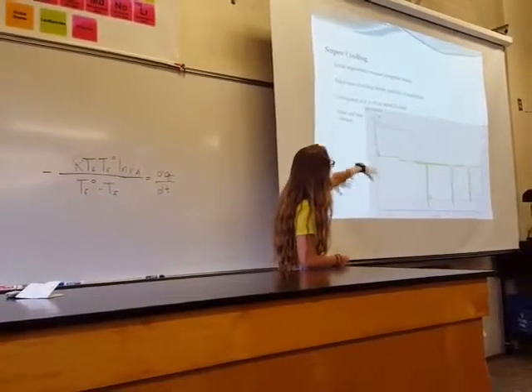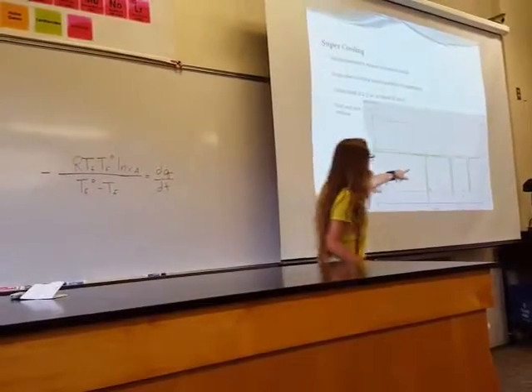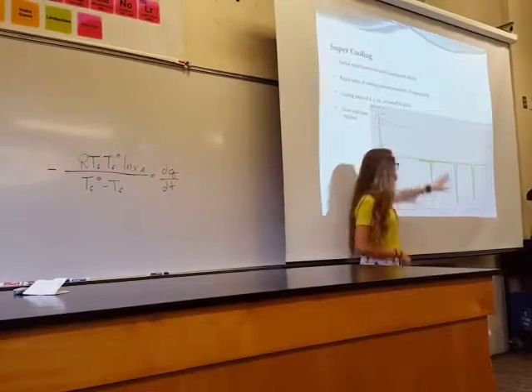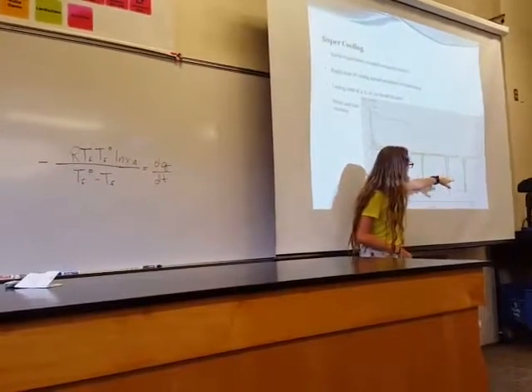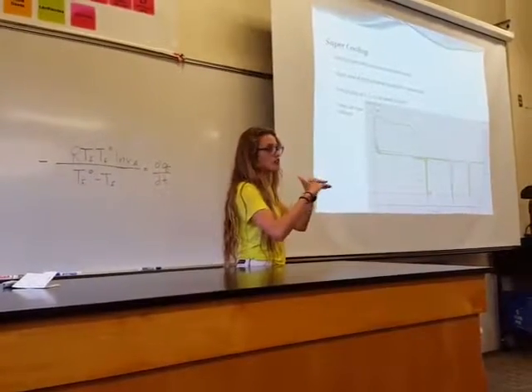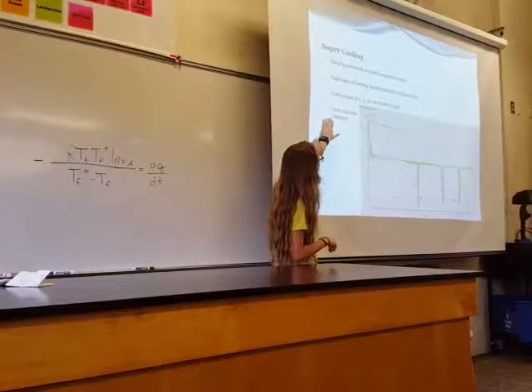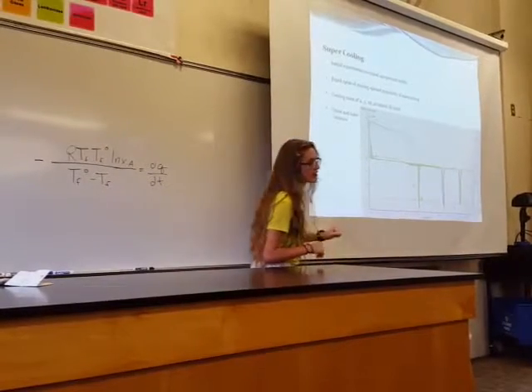And so we did a series of runs with rates 2, 3, 7, 20. And here on this graph is shown rates 2, 3, 10, and 20, which didn't, because the rate of cooling was so fast, the 20 wasn't able to hit the freezing temperature. But what we saw is that as the rate of cooling increased, the freezing point of the solution decreased or became more negative. And so right off the bat, we were able to see that there were changes in the onset and time variance, and also slight changes in the area under curves.